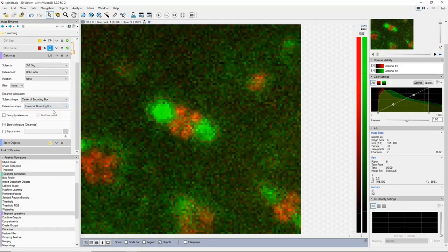If you measure the distance from center to center, you'll get the fastest results. If you get center to surface or geometry, you can get some more accurate results as long as the subjects are relatively small. But if you need to measure edge to edge, you can still do this. So it's just a lot faster, and you'll be able to see this in a second.